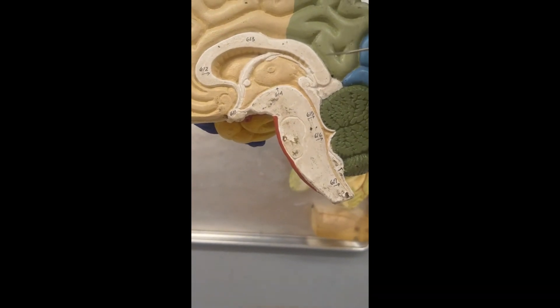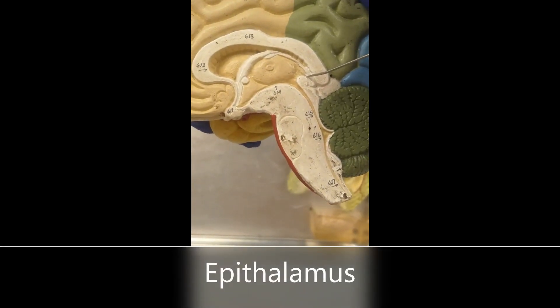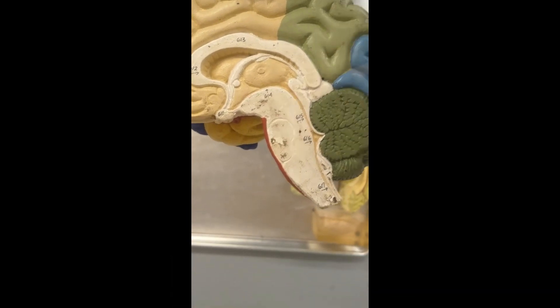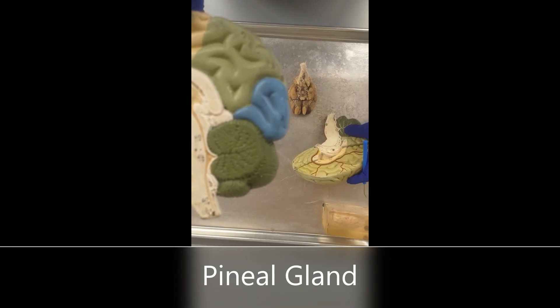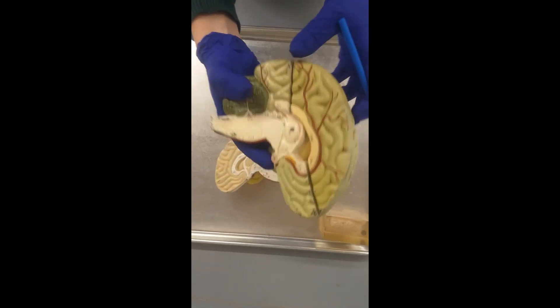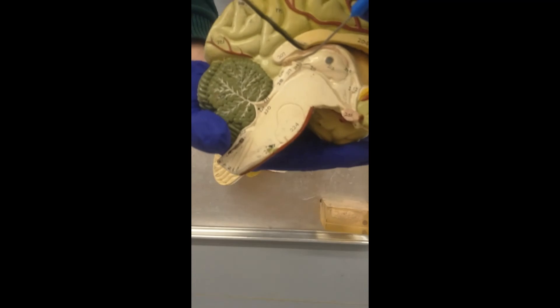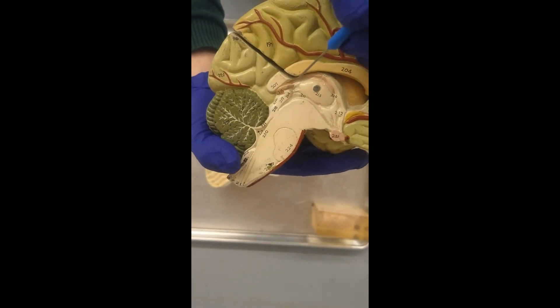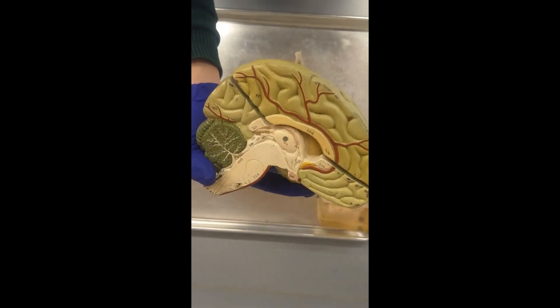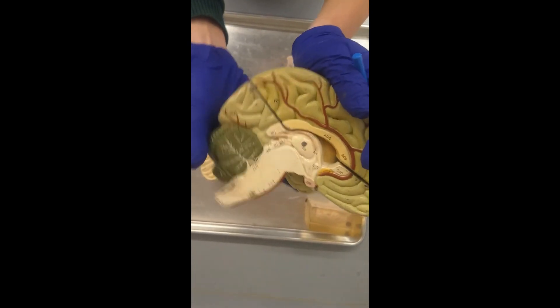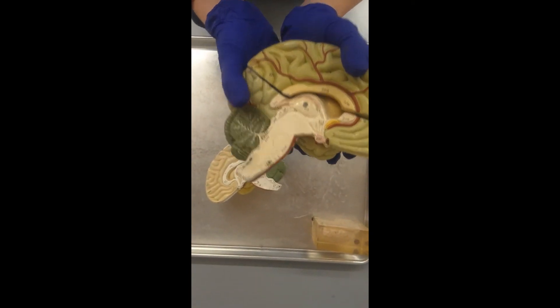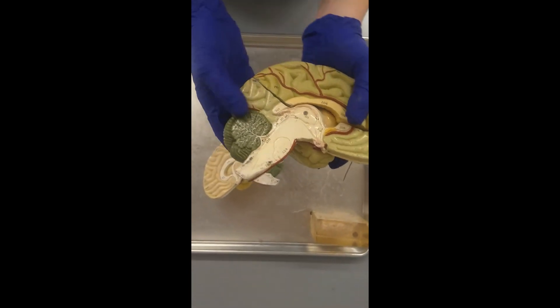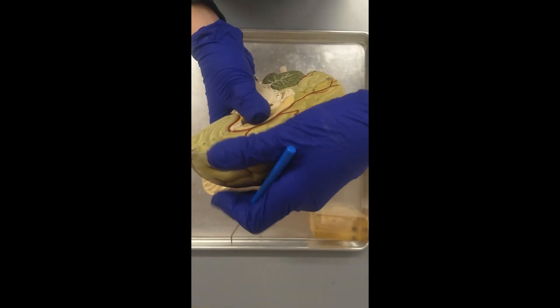The epithalamus — 'epi' means above. What we're looking for here is the pineal gland, or pineal body. This is what people refer to when they say 'open your third eye' or 'decalcify your pineal gland.' This is very important in your circadian rhythm and your sleep-wake cycle — it produces melatonin to regulate your circadian rhythm.